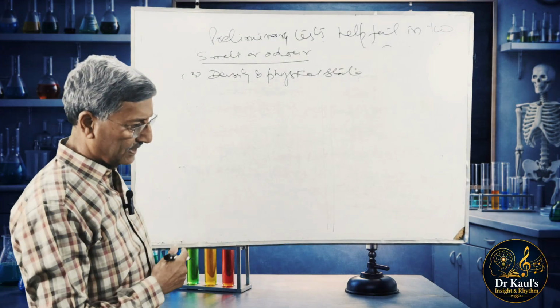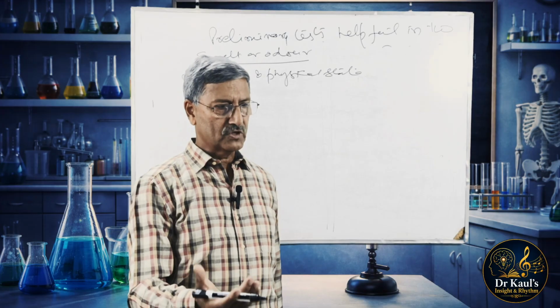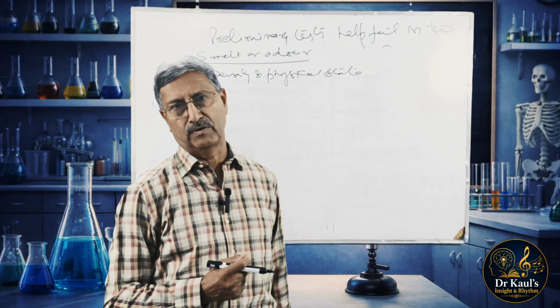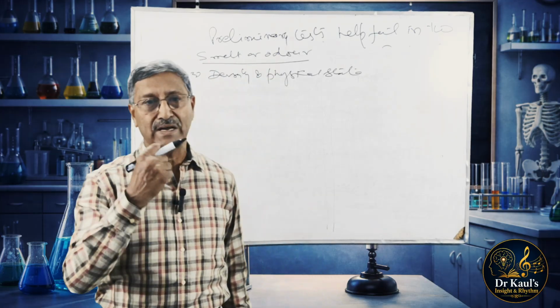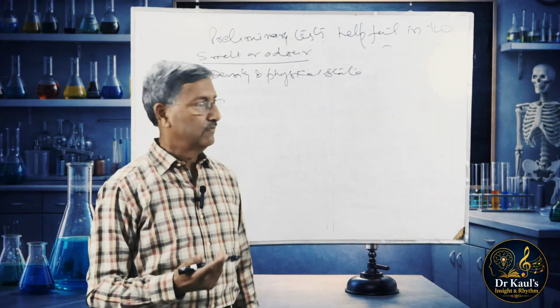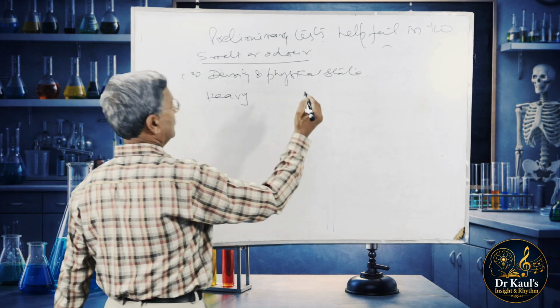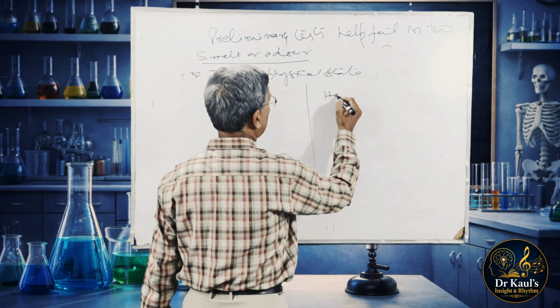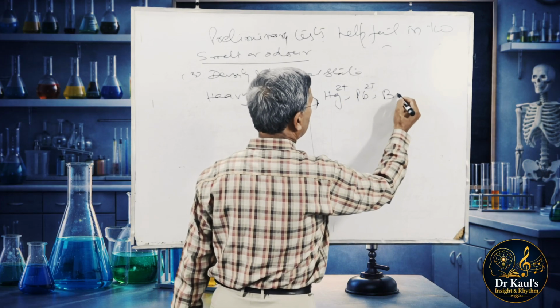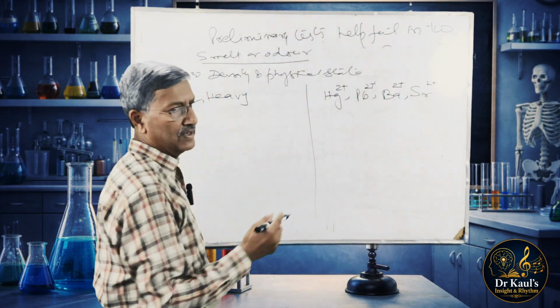What do you mean by density? You see, we take a small amount of the salt on a watch glass and just weigh it, or you can have it on a paper and just have a feeling of the weight. There are certain salts which are heavy, and a salt slightly heavier than the normal salt will give the indication. If heavy, then it could be due to salts of mercury. Some salts of mercury, then lead, barium, strontium, etc. are heavy.